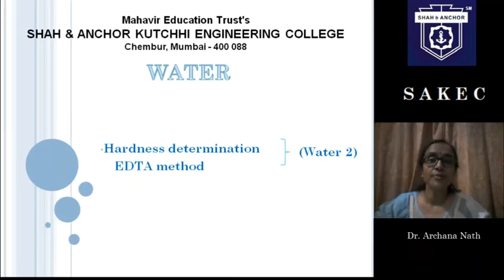Hello everyone, welcome to lecture 2 of the topic water. What we will learn today is determination of hardness by the EDTA method.